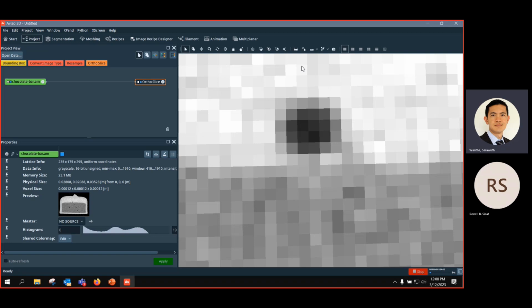And then if I go again to this very bright area here, I go to the probe tool and click for update shift. So I press shift and click, and you can see now the value is about 1,340. That means you work in 16-bit and the value could go up to 60,000 in terms of change of intensity. And this is how you probe the individual pixel intensity.